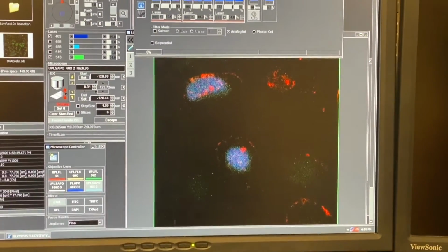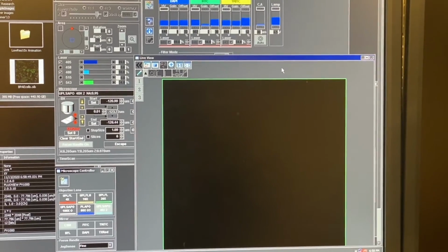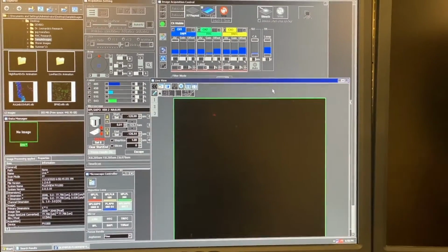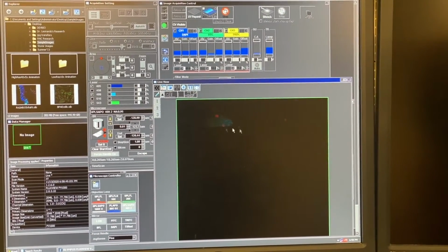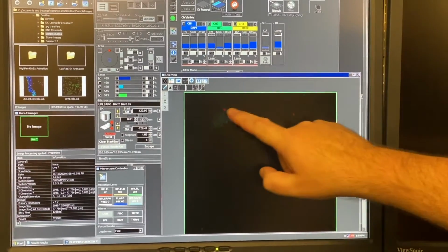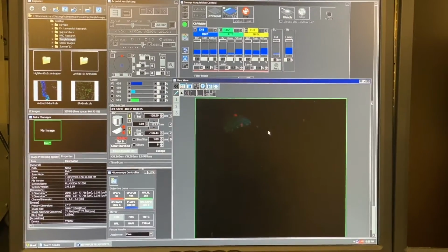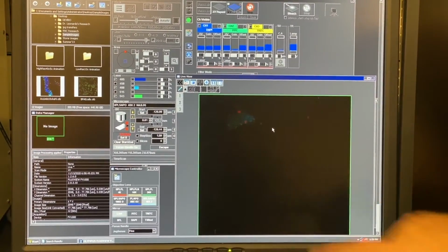And we'll repeat, stop, and we'll do a higher intensity scan. So it's just as slow as the other time we took a picture. It's going through this area at a very slow pace with the laser to cover. We have optically zoomed in, and now we can get incredible detail of what's going on at that one cell. Looks like maybe I would like to bump up the red again if this cell doesn't come in here.